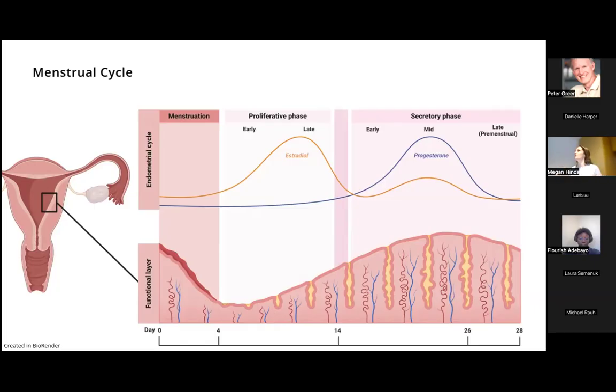So just based on the optimization, I lean towards magnetic activated cell sorting and things like density gradient centrifugation, because that's something we can do in our lab that day without needing an appointment or extra preparation. So that is a limiting factor in terms of what I consider for potential methods, I guess.